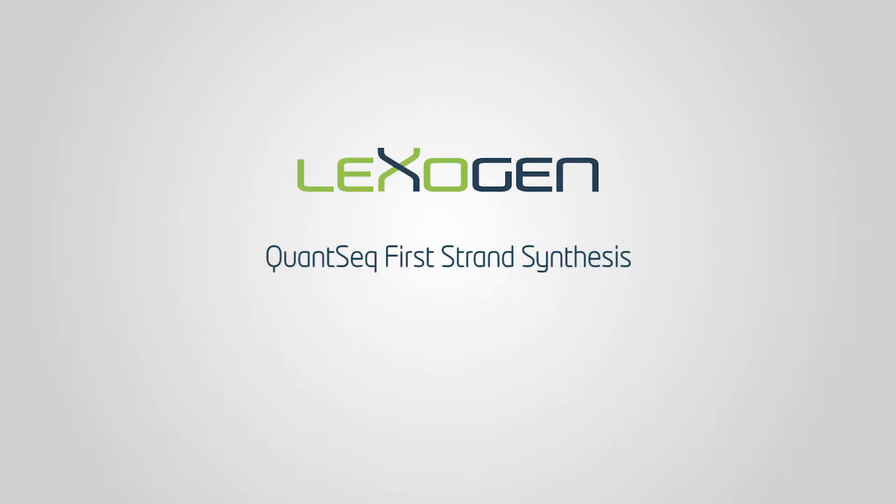Welcome to Lexogen's technical video series. Today we'll take you through the steps for first strand synthesis in the standard QuantSeq 3' library prep protocol.